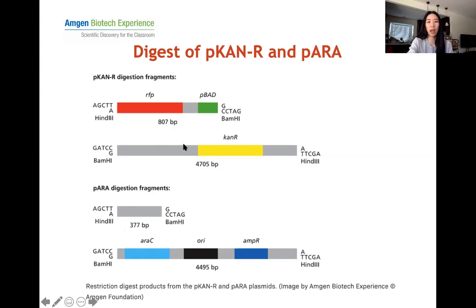And if you look at this piece, it would complementary base pair with this end because this is where it got cut. And then on the other side, you have the sequence that's cut by BamHI, and this would match up to this piece right here. So that is just what they're trying to show you with these extra bases on the end: those are the sticky ends that are produced when you use those restriction enzymes.